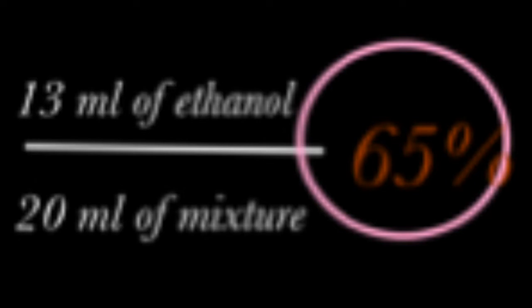65% ethanol, and for fractional distillation, the data is read as the temperature might have shot up at or after the 15 milliliter mark. So the percentage calculated from fractional distillation is 75%. By averaging those two sets of data, the unknown ethanol water mixture is 70% ethanol and 30% water.